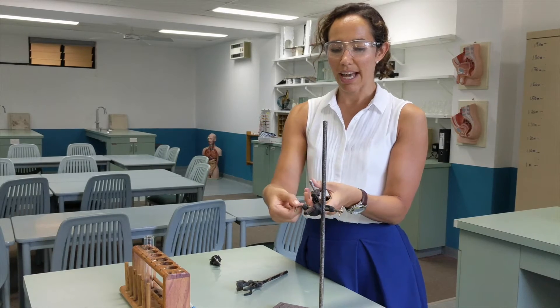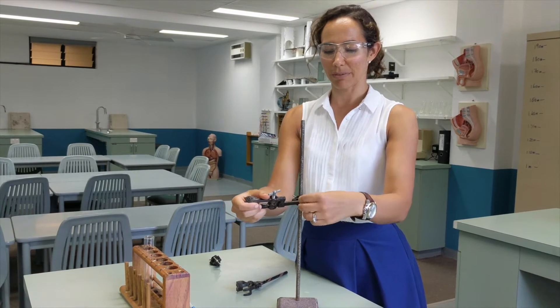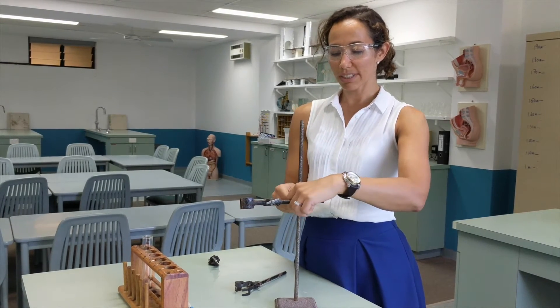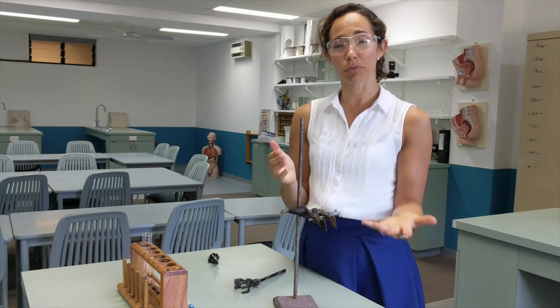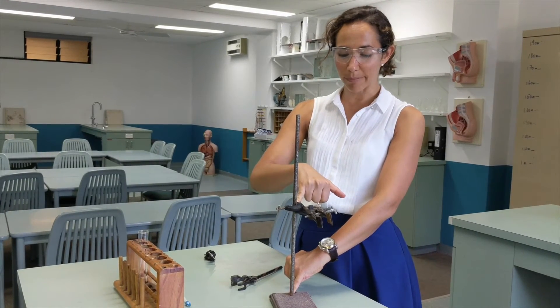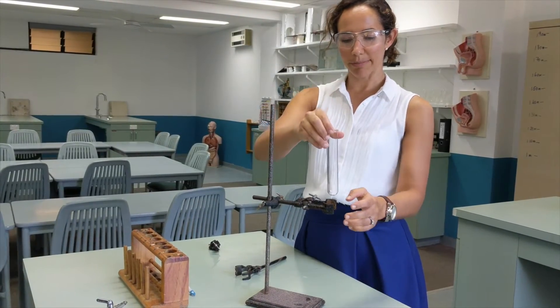Then you use the screws to tighten the boss head in place so that it's firm, and then you can screw in and position the clamp so that it's firmly in place too. Once it's all set up, you can make any adjustments you need. Quite often we use these to set things up to a certain height, so you could use a ruler to measure the height of the boss head.